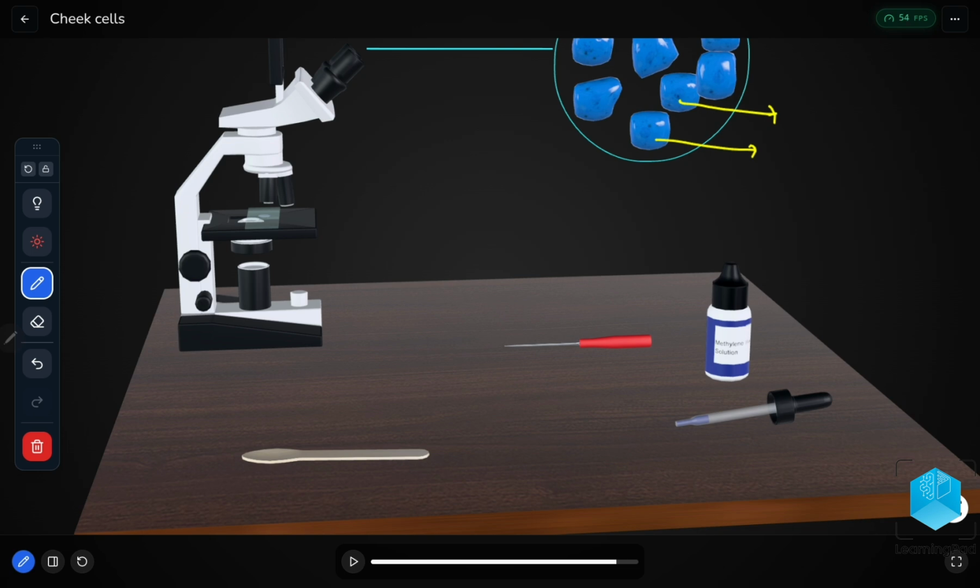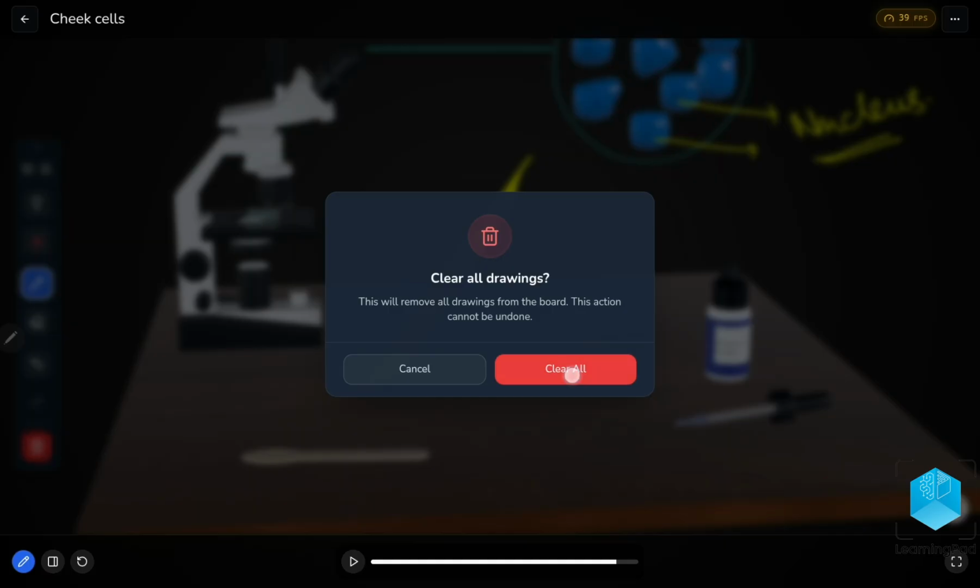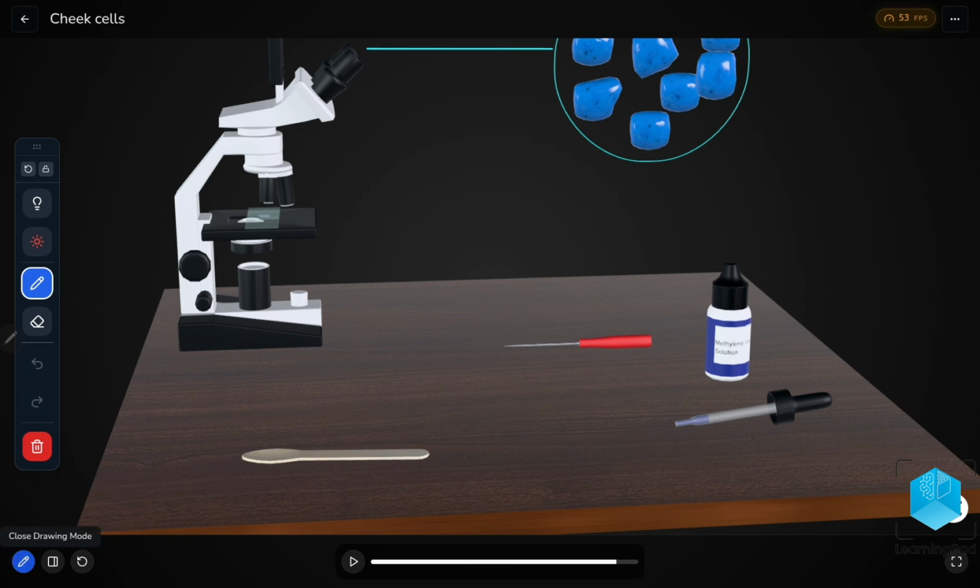Animal tissue, like the lining of the mouth, is made of cells, and this includes these cells. You all know that they contain a cell membrane, then cytoplasm, and these dark dots which you see are nothing but the nucleus. And there are many other organelles in the cells. So did you understand how to study the cheek cells under the microscope?